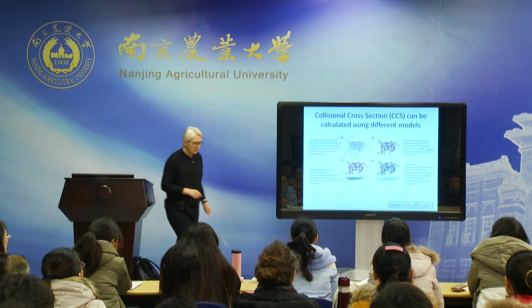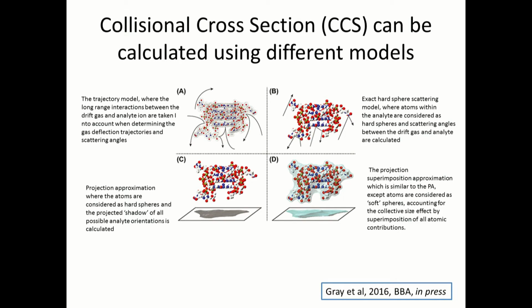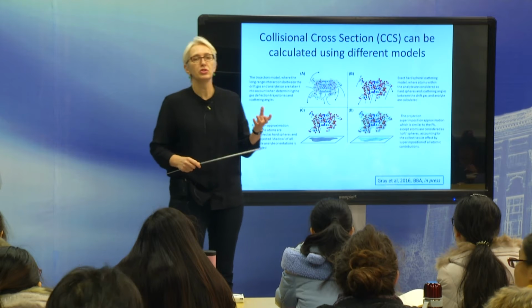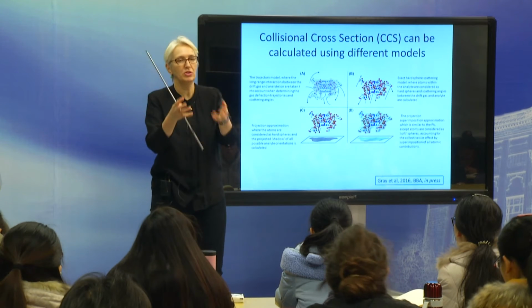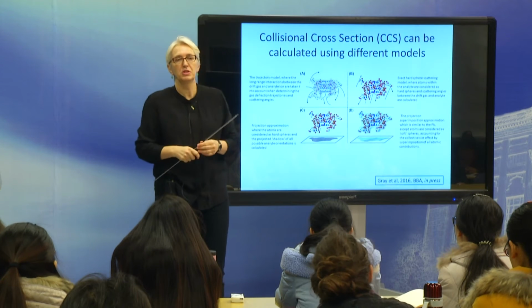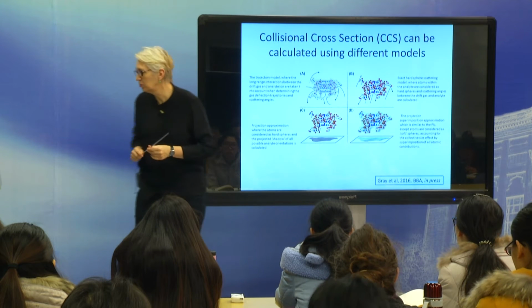And nice thing is also with this method, in combination with getting experimental data, you can also try to calculate what the drift times might be. And basically what you're looking at, as I said, if these molecules have different shapes, you look at what we call the collisional cross-section. That means, how big is this molecule? The molecule obviously tumbles around a lot. How big is this molecule, and what's the chances it interacts with this drift gas? This can all be calculated much beyond me.